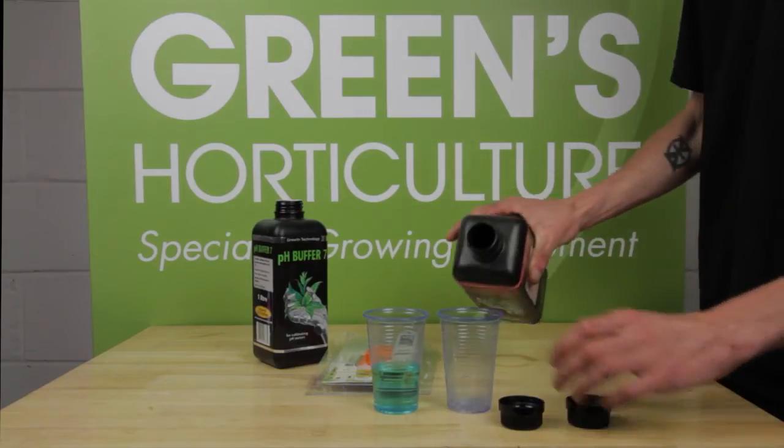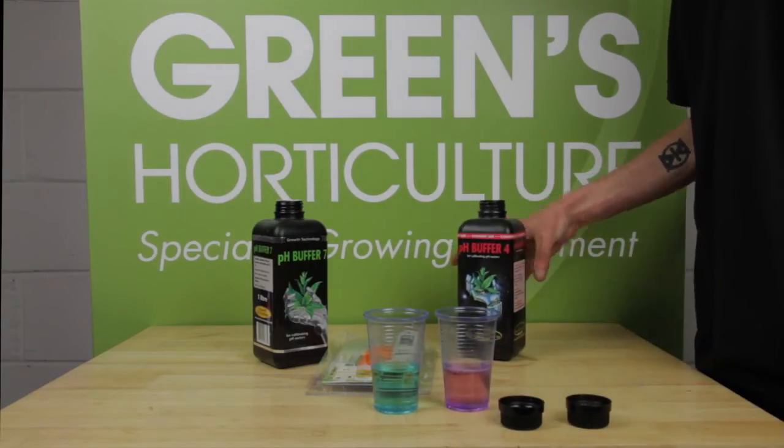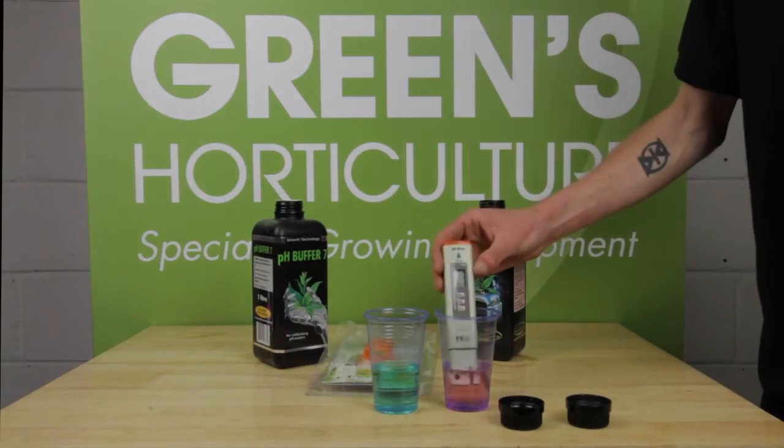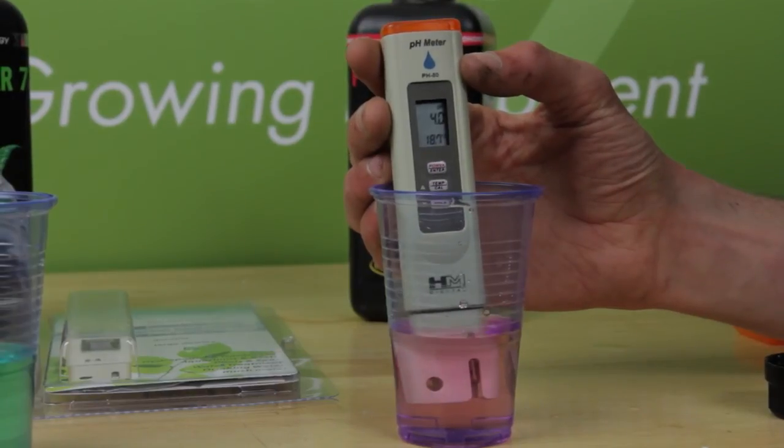We can't overstate the importance of accurate pH readings to your successful grow, so we would recommend testing the pen in another pH buffer solution. We're using pH 4 buffer for this. Simply immerse the pen in the buffer 4 as before and check your reading — ours is spot on.